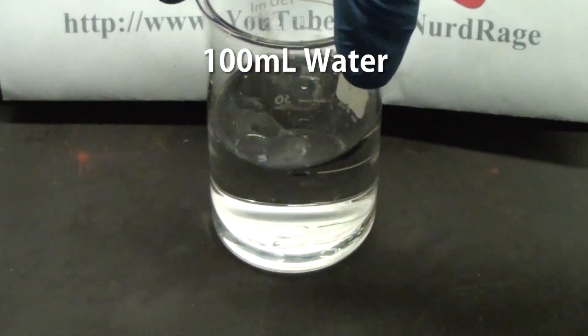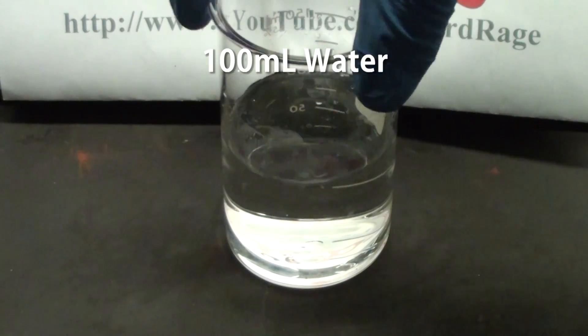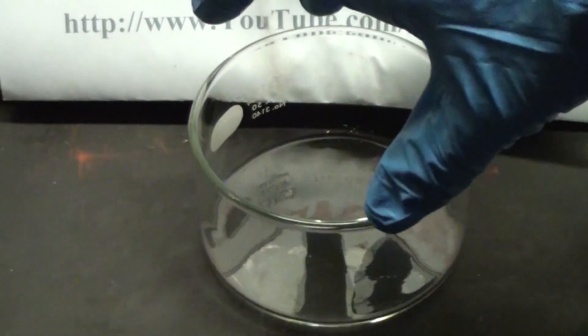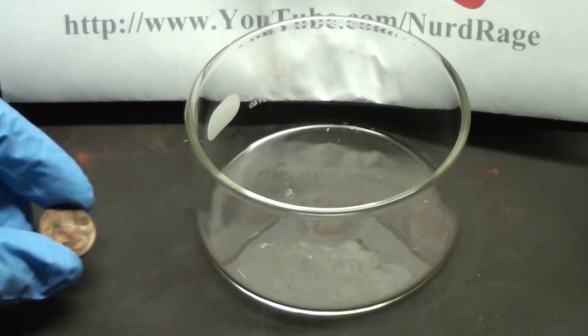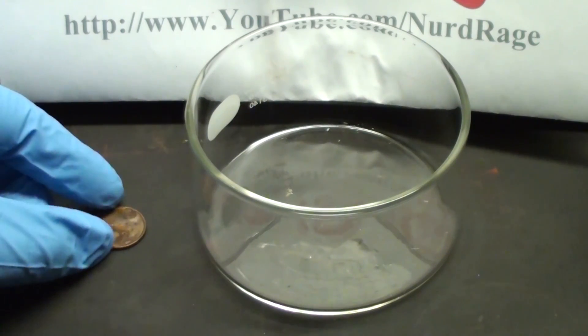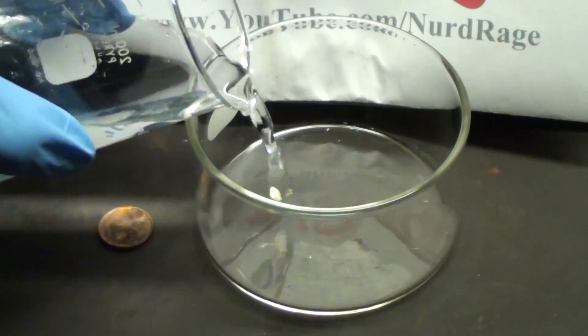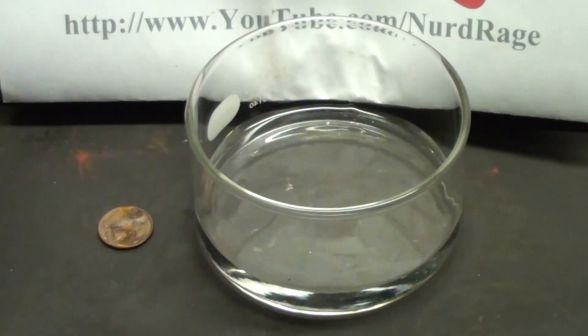We are now ready to do the experiment. Get a deep dish and a piece of copper metal. In this case we're going to use this penny. Now pour enough solution into the dish to cover the bottom.